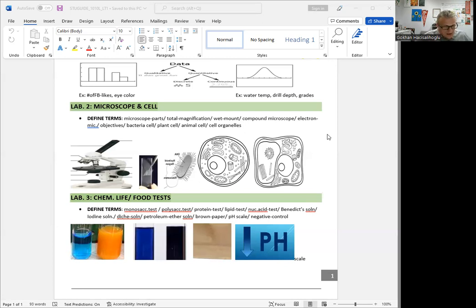And then we measure pH, right? So you use test tubes and always have a negative control, like water, that should not change color. Then you had four or maybe more test tubes with different food items in them. Always, we needed high temperatures for heating carbohydrates, but we never heat protein or lipids, because they denature. Don't forget, proteins can denature if you heat them, so they get damaged.